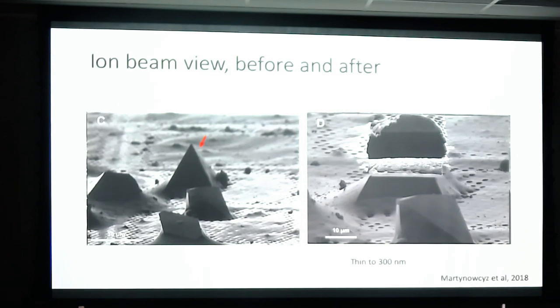There'll be another lecture on this later in the course where you're using this for cells, and for cells that's the more commonly used thing where your cell is too thick for EM, because again, the EM sample has to be thinner than say half a micron. So you put it into a FIB-SEM, blast away the top and bottom of the cell, leave just the middle bit, and then look at that by tomography. In this case, they're doing that technique for crystals.